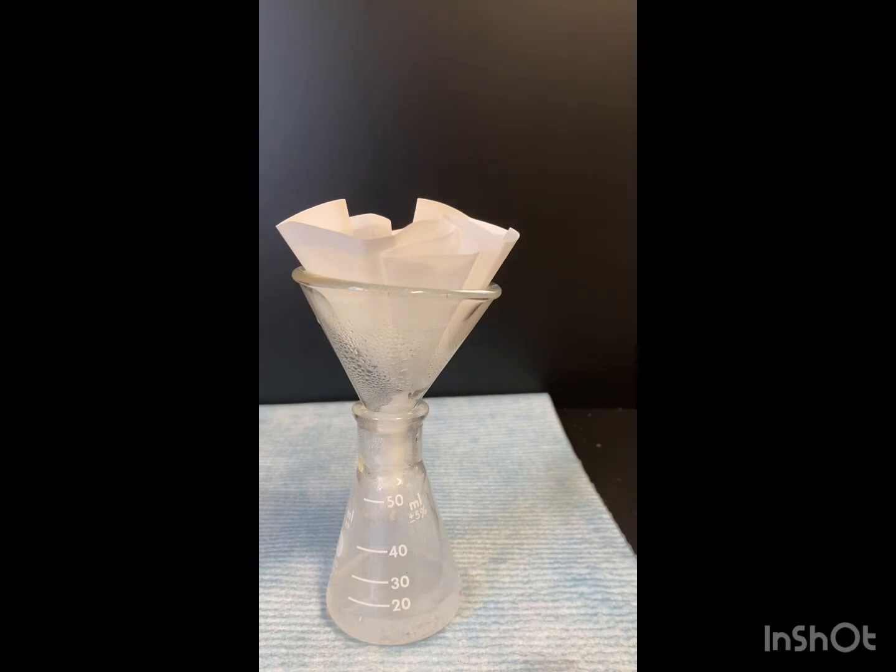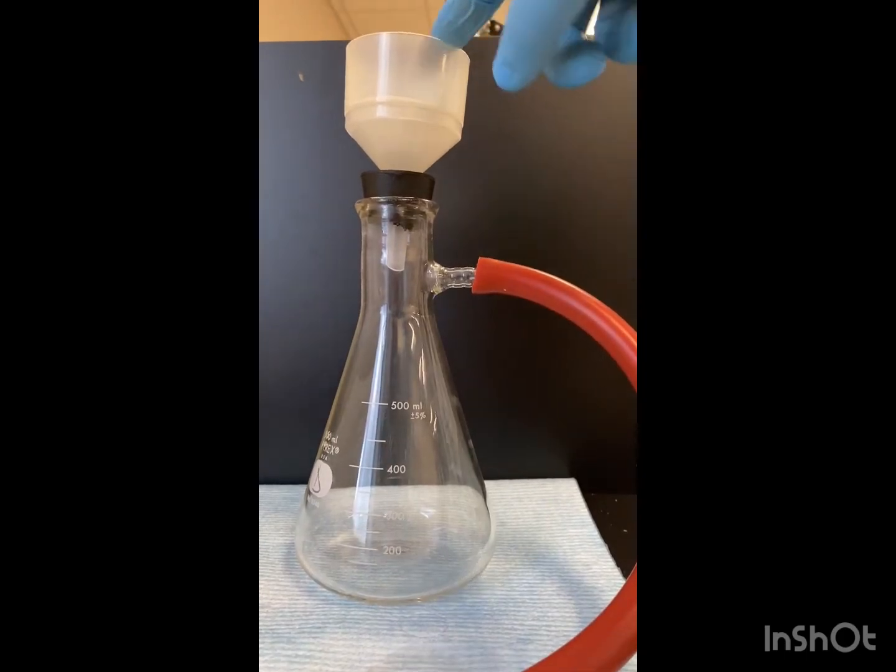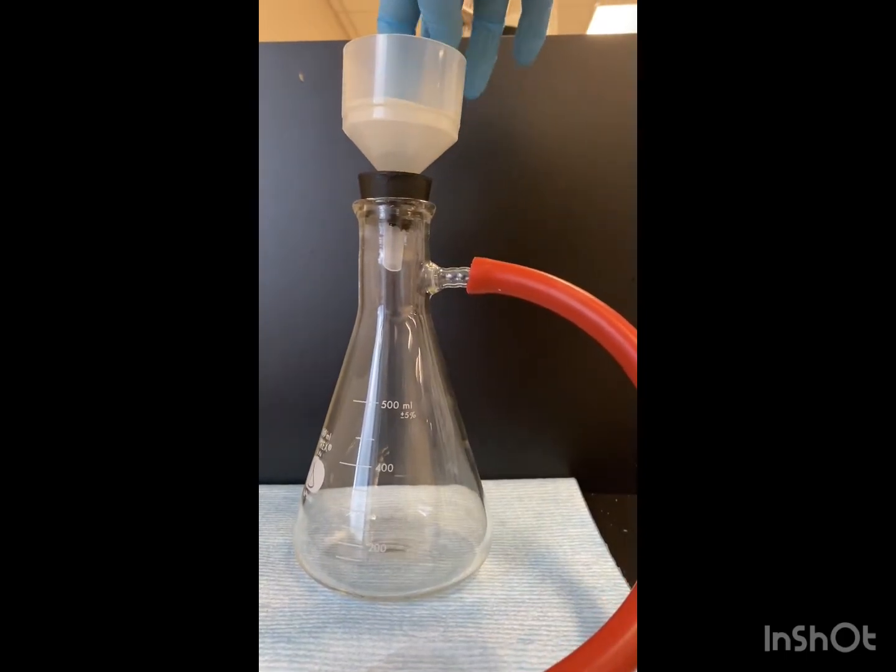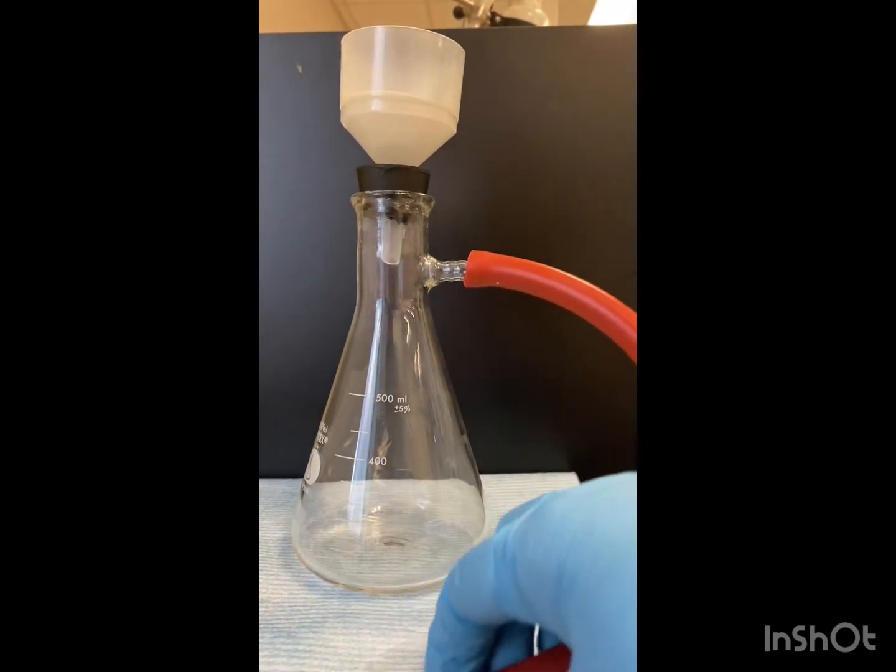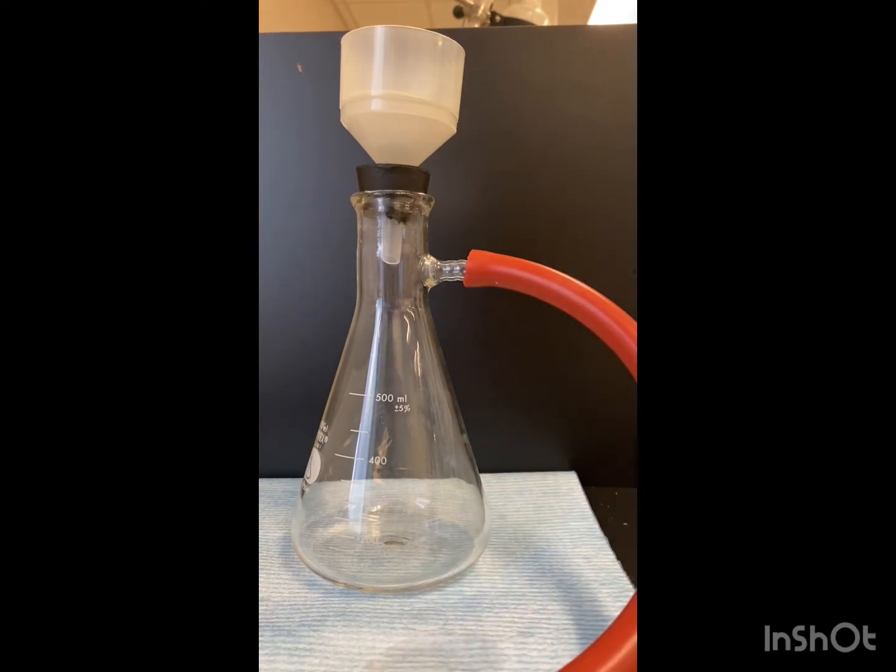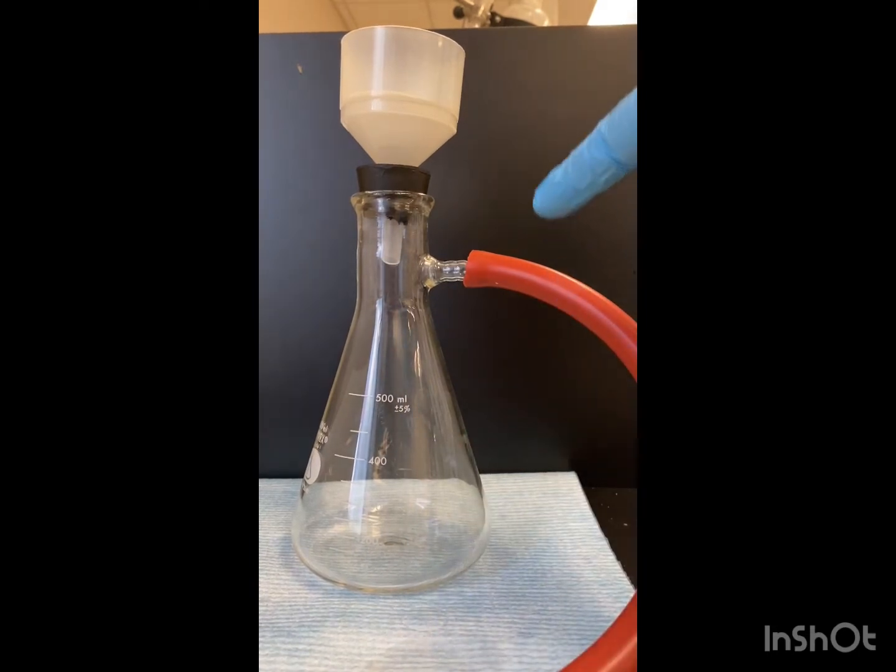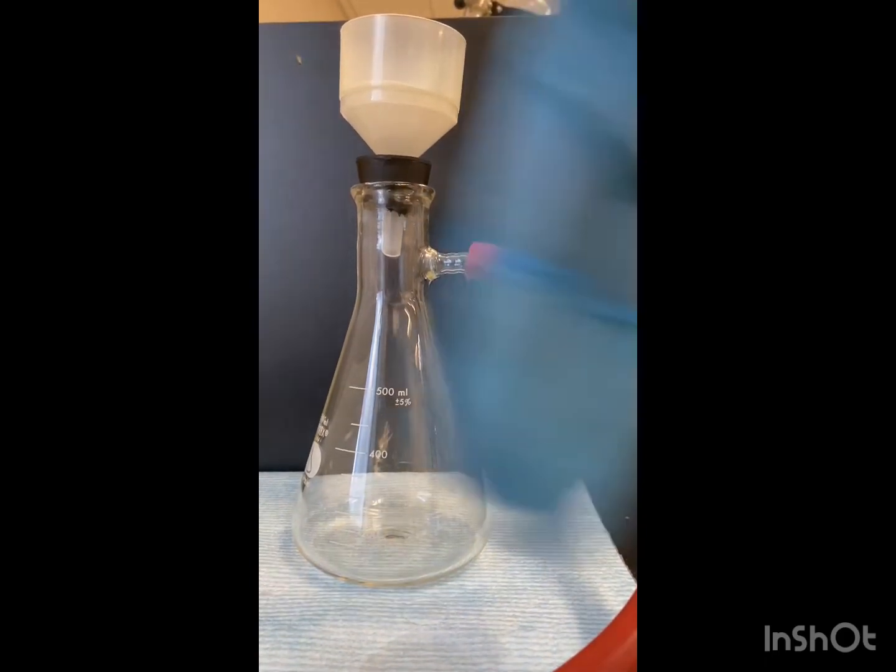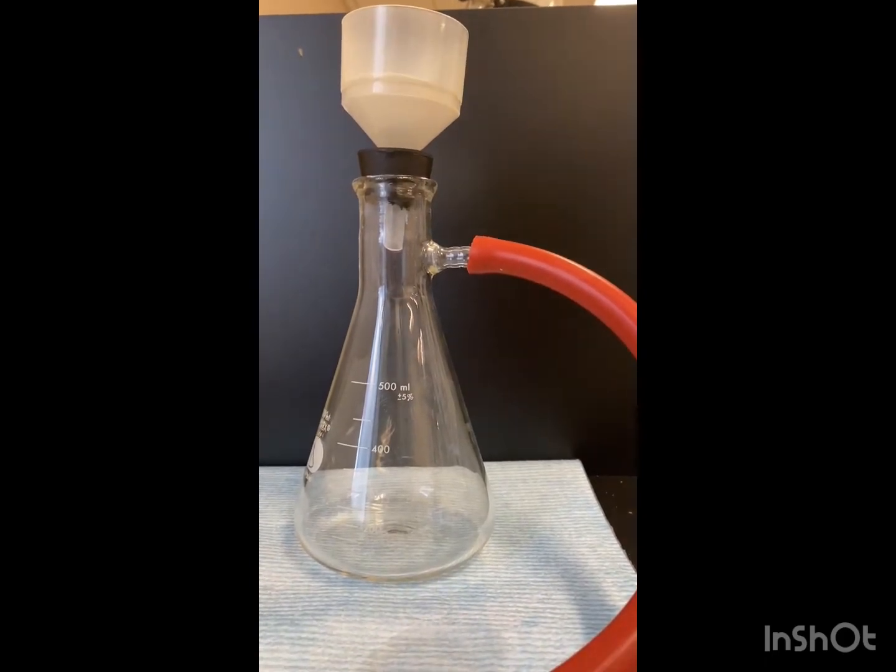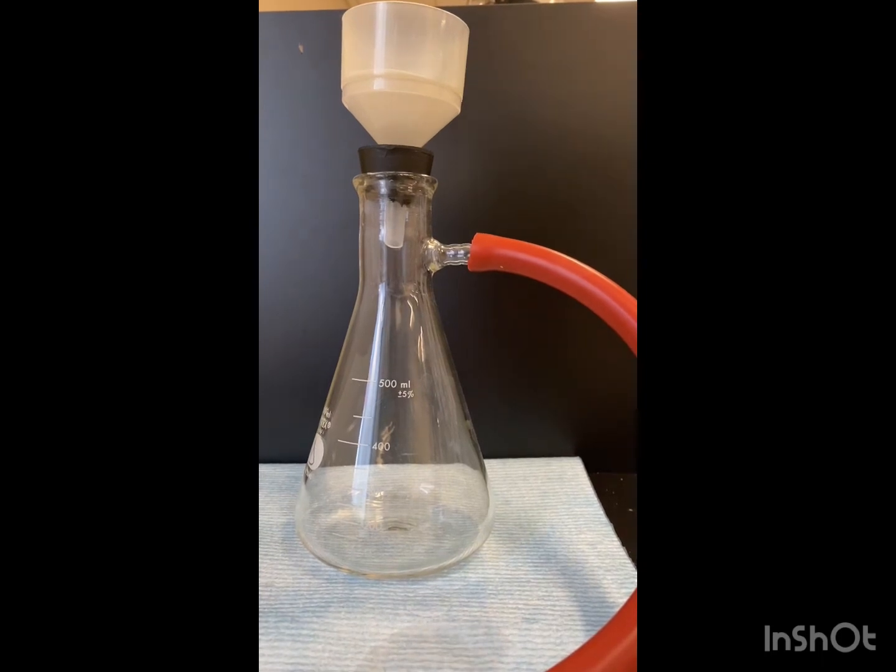Another thing we can do while we're waiting for this is to set up our vacuum filtration setup. So this is our vacuum filtration setup. You're going to have a Buchner funnel with filter paper inside, this adapter, a filter flask, and your red vacuum hose to hook up to the vacuum. You can also put this on a ring stand and clamp it, but this is for video purposes. In your fume hood, you can clamp it.